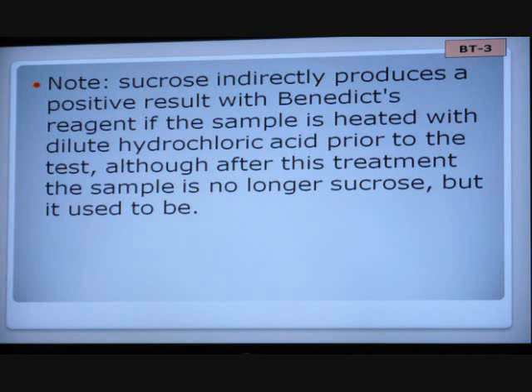That's your strongest result. So as far as weak to strong, green would be your weakest. And that yellowish, it's not the color of mustard, but you'll see it probably. But that's going to be your middle range. If you get a nice red, not red like Jared's shirt, I don't see a red like this in here at all. But if you picture a brick, I don't see any bricks. But you know, bricks are red, right? But they're not fire engine red. That's what you're looking for. That's in your book, though.